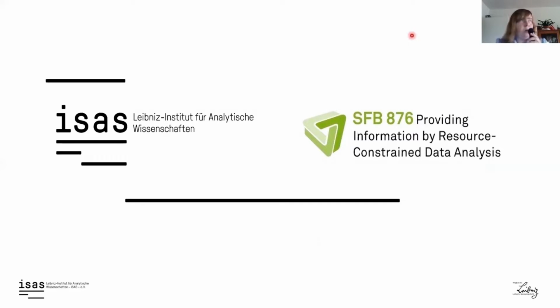As you already noticed, this is a joint project. ISAS develops the instrument, the PAMONO-sensor, and our colleagues from Technical University of Dortmund help us develop software.